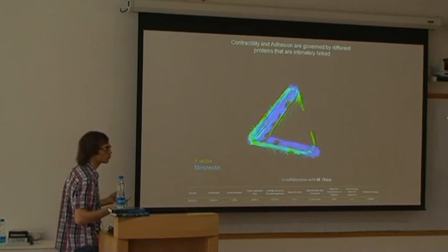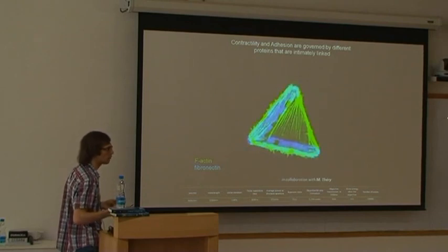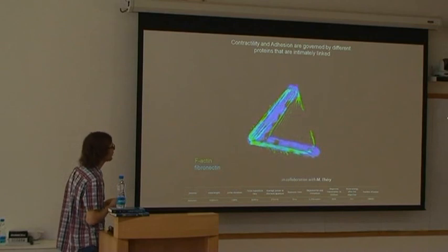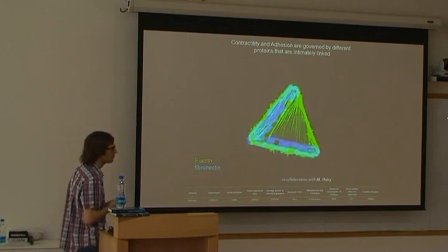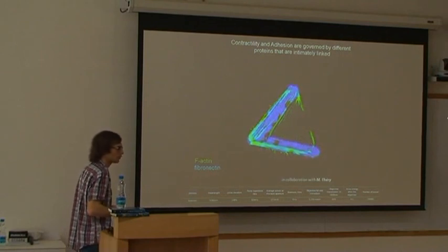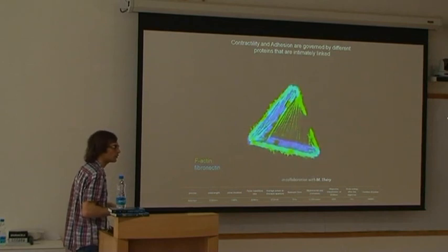So this is really retraction of the fiber. The fiber was definitely cut, and definitely this fiber was retracting. I cannot tell you how much this was depolymerizing. But definitely the fact that we're releasing tension from these edges is changing the adherence of the cell to the extracellular matrix. So it's doing something there.